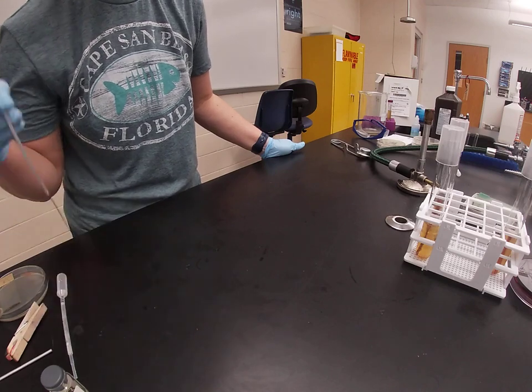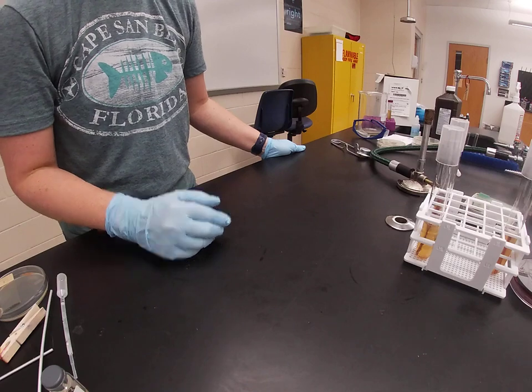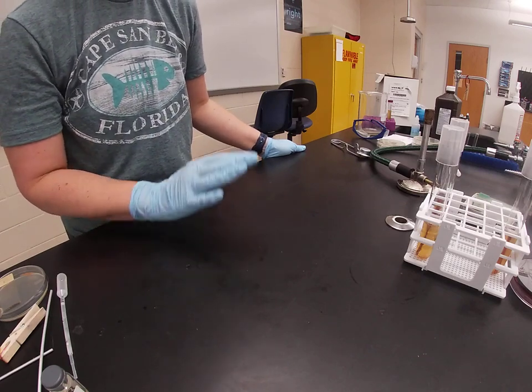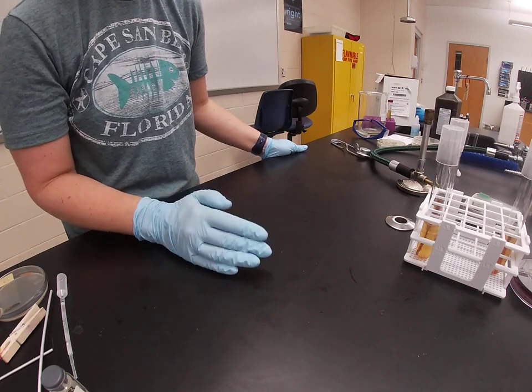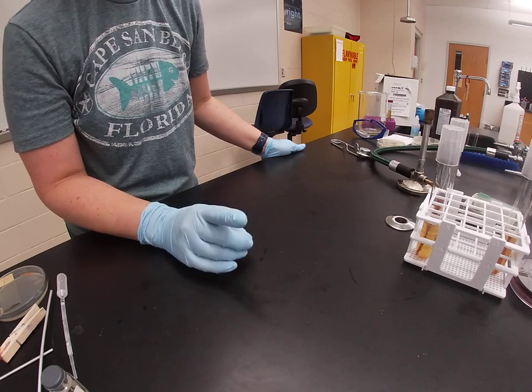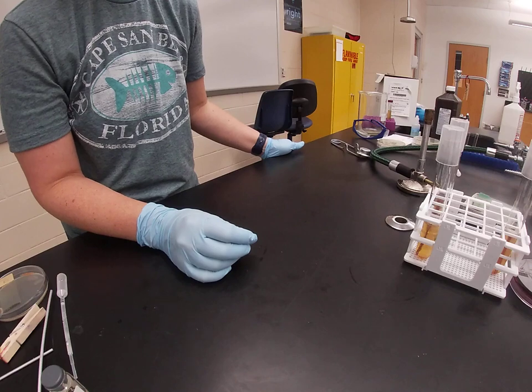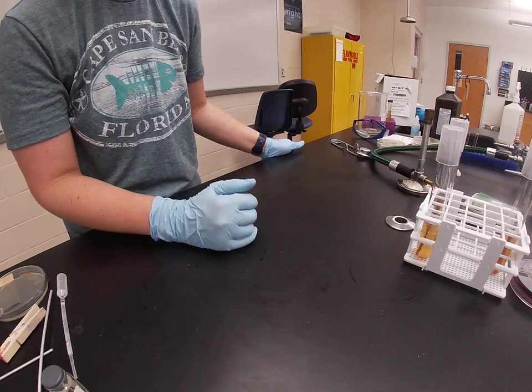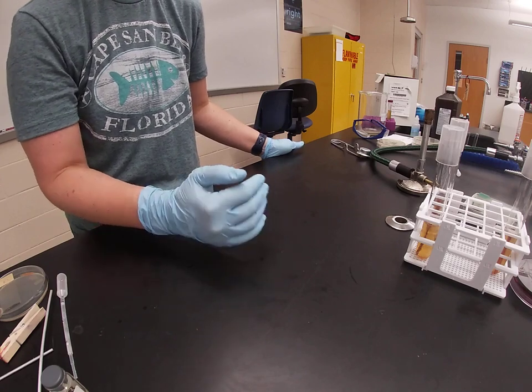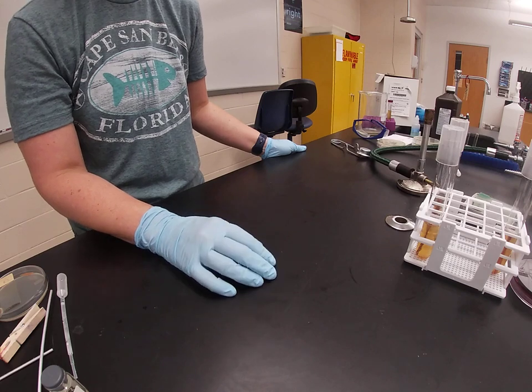Motility agar is actually much in composition like nutrient agar. It has various vitamins and nutrients and all the things that bacteria need to grow. It's not selective in any way. Everything can grow on motility agar. It has one interesting addition, and that is tetrazolium salt. Tetrazolium salt turns red around bacterial growth. So with motility agar, you can see where the bacteria are growing because they will be growing red instead of the normal clear or kind of cream colored.